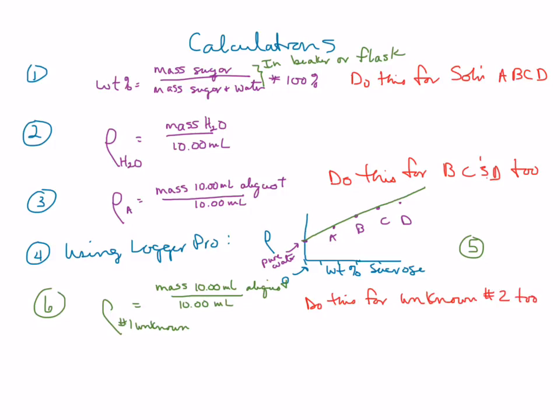So now the coup de grace, and actually if you're looking for what to include in your summary somewhere, you should tell me what the weight percent of these are based upon the densities. Okay, so that's probably the biggest thing I'm looking for. What's the weight percent of sucrose in these? Remember, one's diet and one's not. Okay.